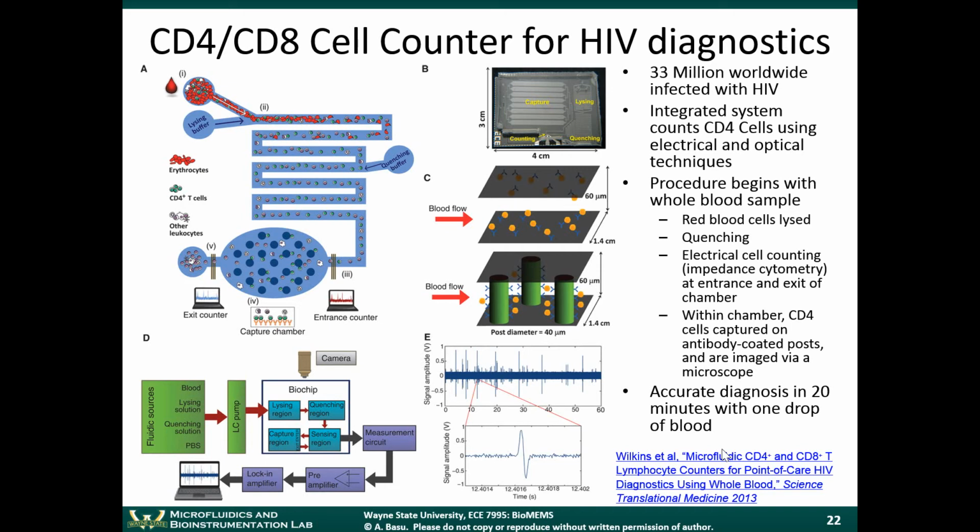This integrated system counts CD4 cells using electrical and optical techniques. It also takes advantage of microfluidic techniques to separate the cells. So let's take a closer look at this system. The procedure begins with a whole blood sample, as we can see here on the right. The red blood cells are first lysed. What we're looking at here is this left diagram.